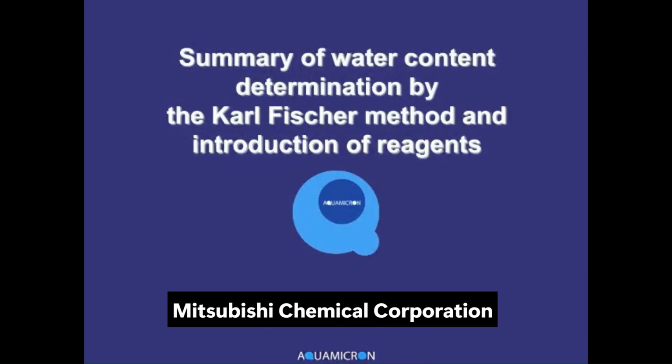Summary of Water Content Determination by the Karl Fischer Method and Introduction of Reagents.